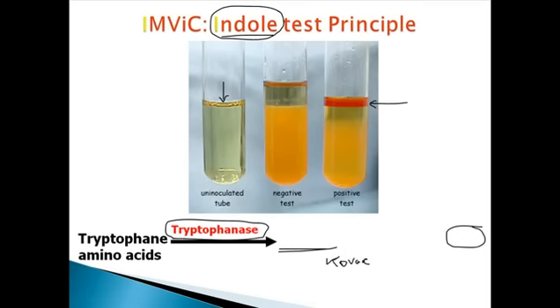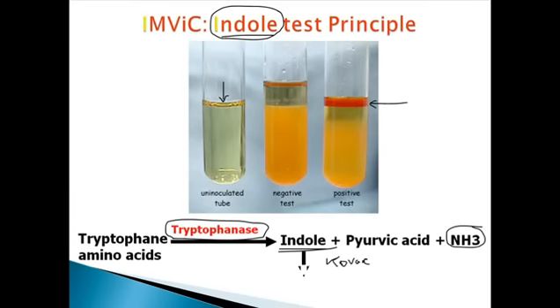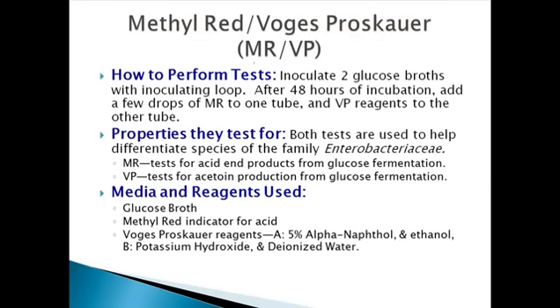If we look at the previous example, some of those bacteria can utilize this, and some of them cannot. That's why you use this selective process, and all the processes we will discuss will be selective processes, and they will help us to determine whether we are talking about fecal coliforms like E. coli, or other types of enterobacteria like Klebsiella. Okay. So now let's talk about methyl red.